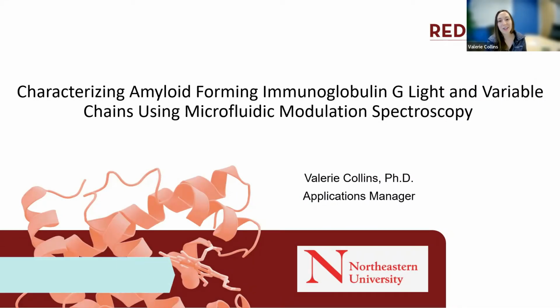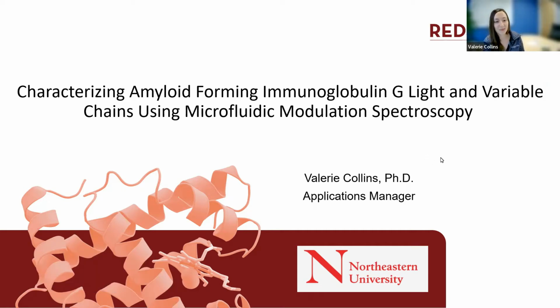I'm the Applications Manager at RedShiftBio, and today I would like to give you a sneak preview at an application note that we have coming out very soon, titled Characterizing Amyloid-Forming Immunoglobulin G Light and Variable Chains using Microfluidic Modulation Spectroscopy. This is a collaboration that was done with Northeastern University.